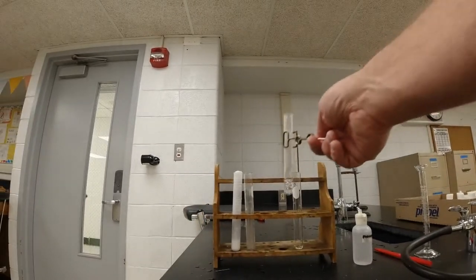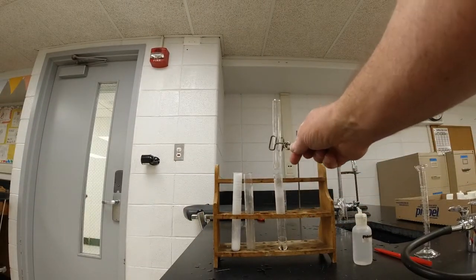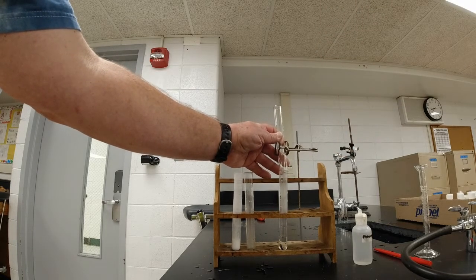I'm going to aim this back over here. I'm going to put that in there. I'm going to grab this one and put it over the top. And I'm going to hold that and try to catch any gas that comes from that one. All right? It doesn't look like I'm getting much of anything going on there.